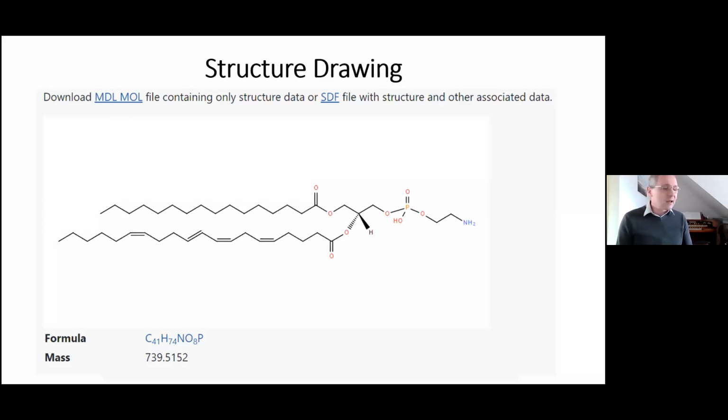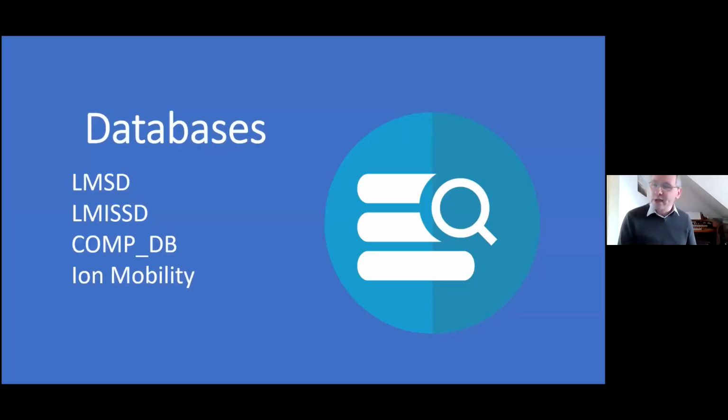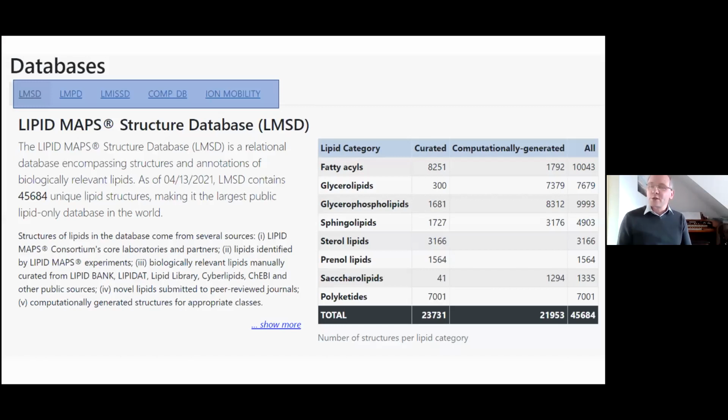So that's basically all I have to say about the tools, because many of them have been covered in lots more detail. So I'll go on now to talk about the Lipid Maps databases, and in particular these 4 databases that we have, not necessarily in this order. And if you click on that link I showed on the home page to databases, you arrive at this page, and up at the top the databases are named there.